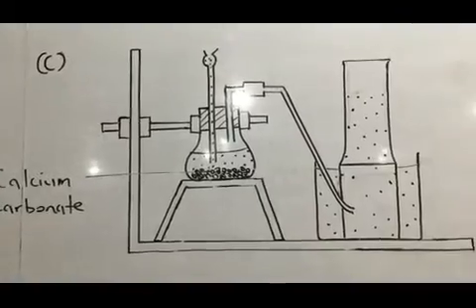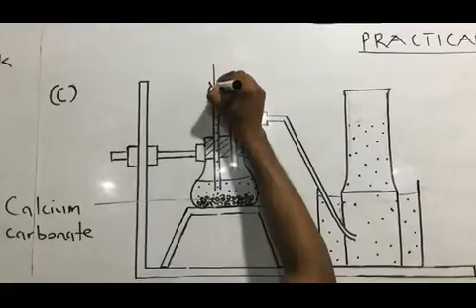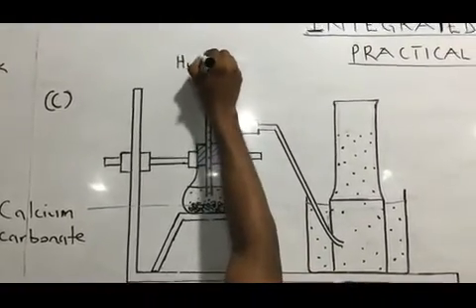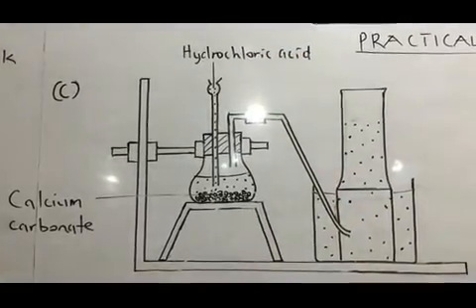And then what is in here is the hydrochloric acid. Okay.